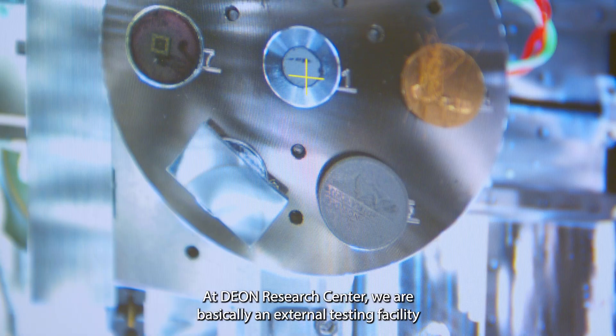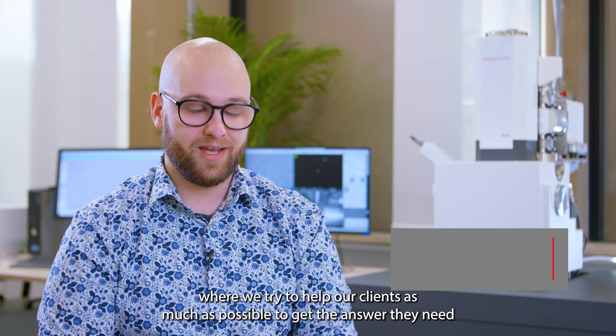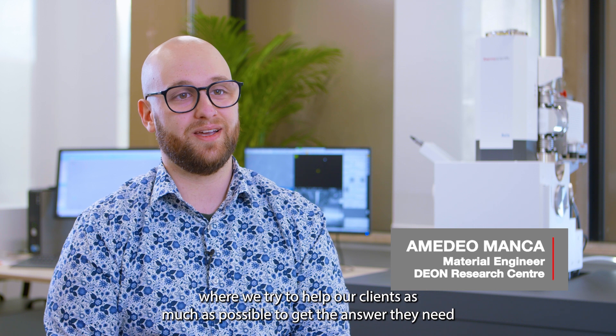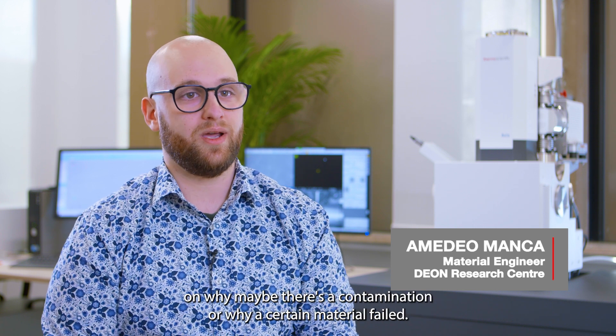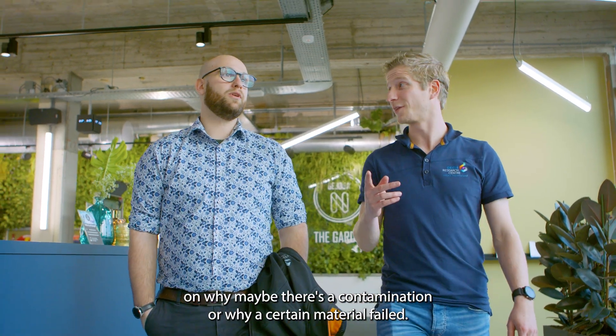At DEON Research Centre, we are basically an external testing facility where we try to help our clients as much as possible to get the answer they need on why there's a contamination or why a certain material failed.